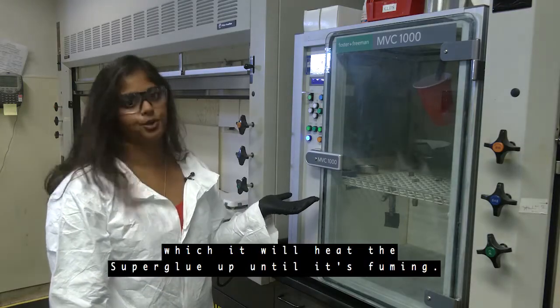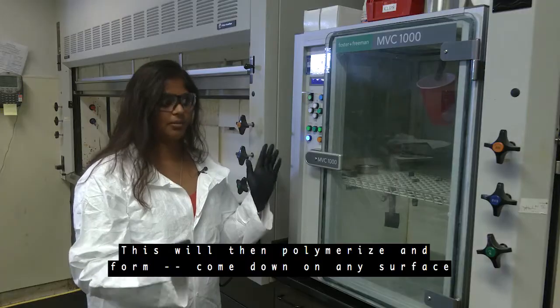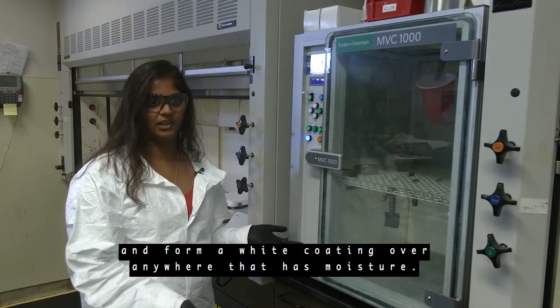It'll heat the superglue up till it's fuming. This will then polymerize and form, come down on any surface and form a white coating over anywhere that has moisture.